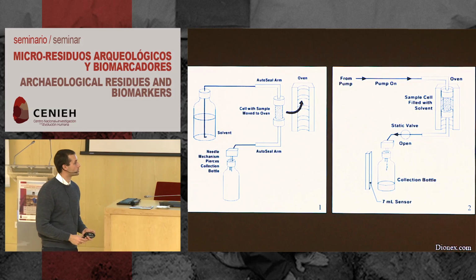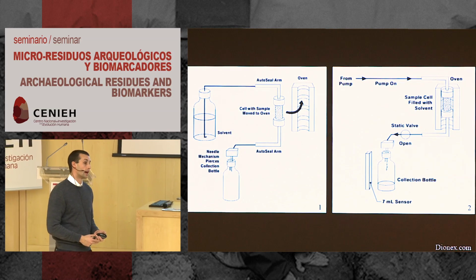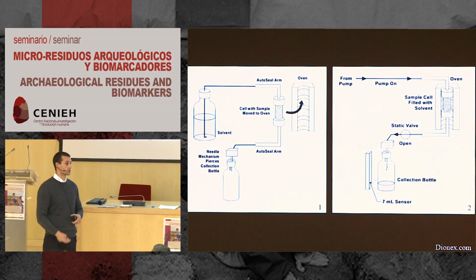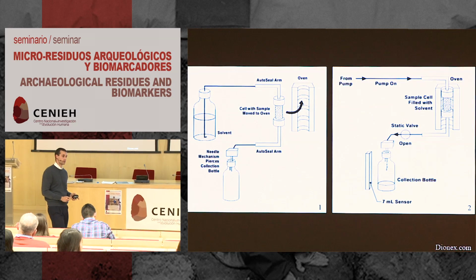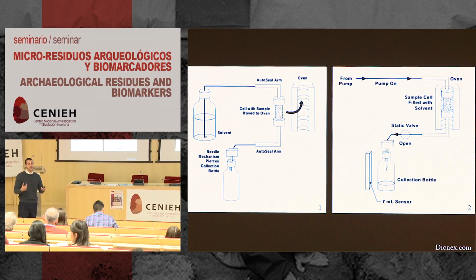I've actually never tried it that way. I don't think so. I know a lot of people who use chloroform, but I learned using dichloromethane and methanol, so I've just stuck to that. And the ratio, some people will do 9-to-1 versus 2-to-1, but that doesn't really seem to show much difference in terms of extracting. So how does the ACE actually work?